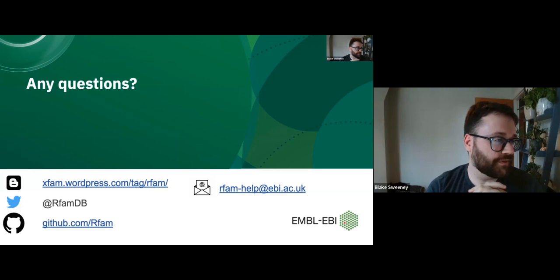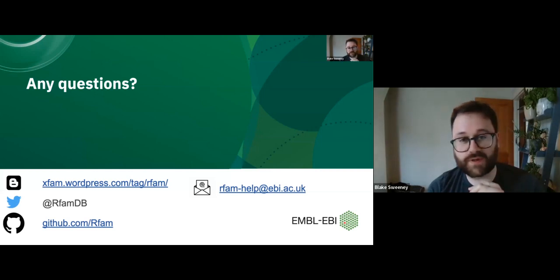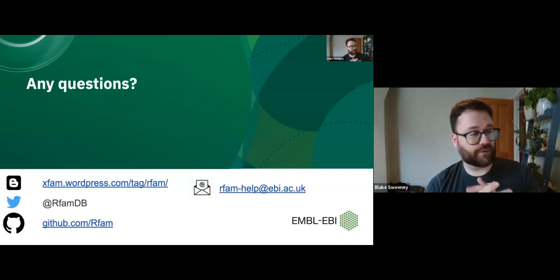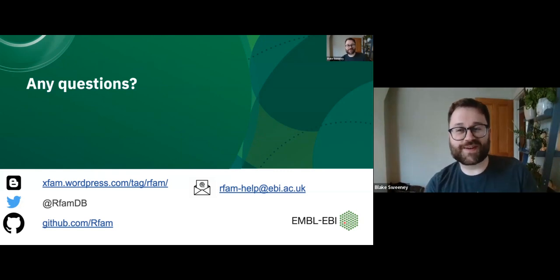So basically, it seems like you're expecting a match to some particular RNA, and you're not getting that match. So there's potentially something, either the model isn't tuned right, or it doesn't have the representation of variation that you expect, and so you want to find homologs in that case. Okay, so I'm going to ask Sam again. I have an idea, but I think Sam's done this, so he would probably be a better person to answer than I am.